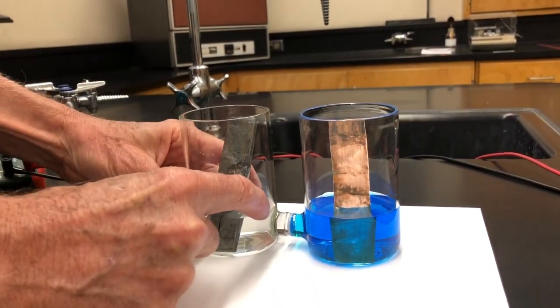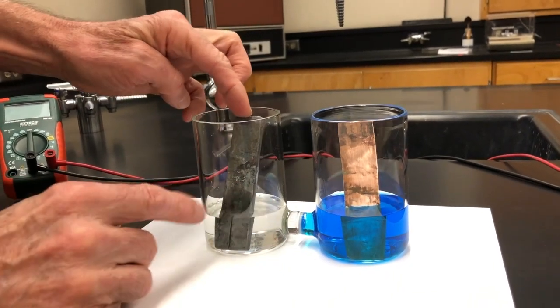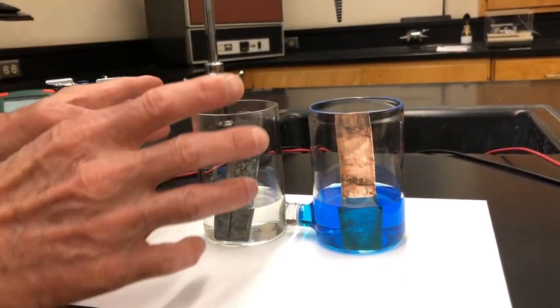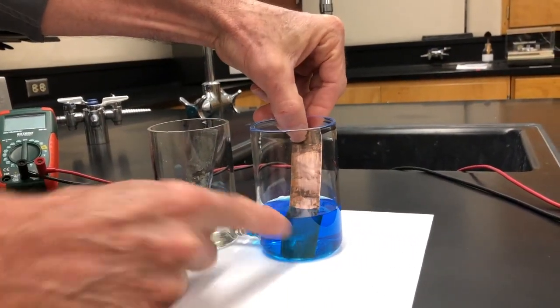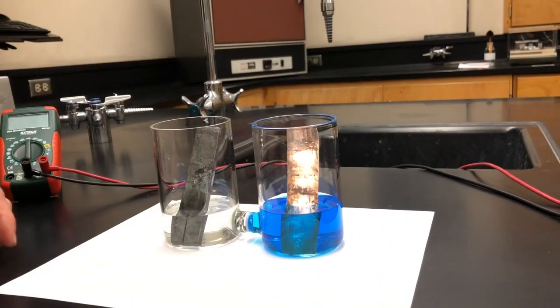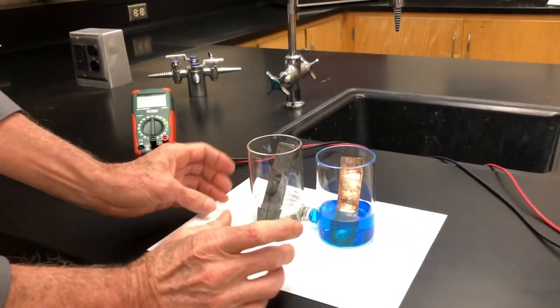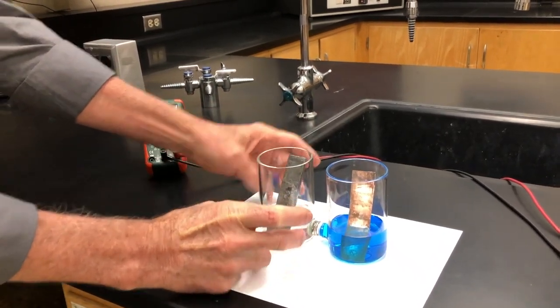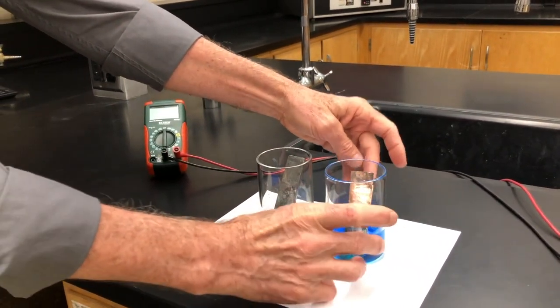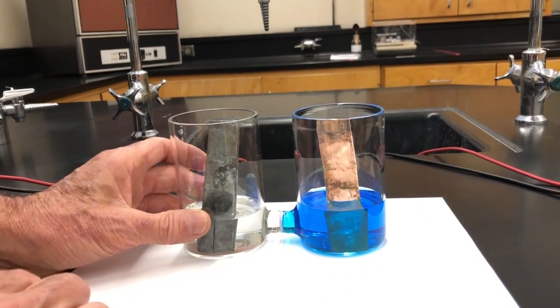This is a beaker containing some zinc 2+ solution and a piece of zinc metal on one side. And then on the other side, we have a beaker containing some copper 2+ solution and copper metal on the other side. This is the fundamental of an electrochemical cell — an element and its ion on one side, a different element and its ion on the other side, connected by a salt bridge that's going to allow a complete circuit.